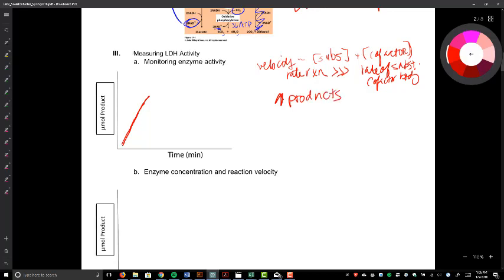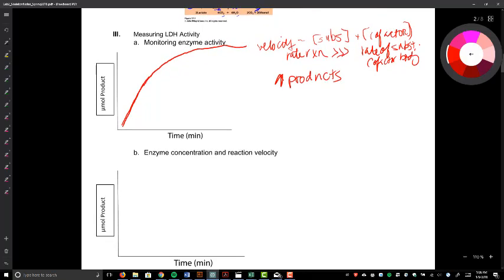And so as the enzyme is running out of substrates, it's going to take it longer to find the substrate and the cofactor, and the enzyme's going to slow down until it eventually runs out of substrate and cofactor completely, and it'll poop out, or will reach the limit of detection for the spectrophotometer. And so this happens because as the course of the reaction goes, we run out of substrates.